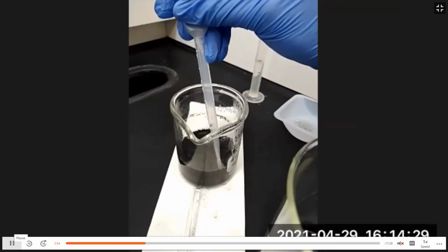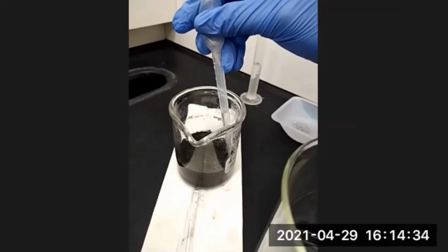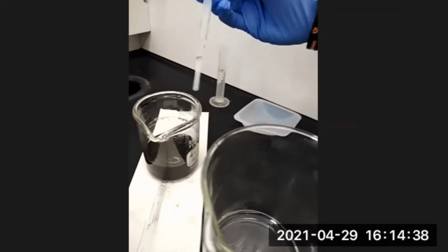It's a very tedious process, but diligence is needed here so you don't pick up any of the precipitate.